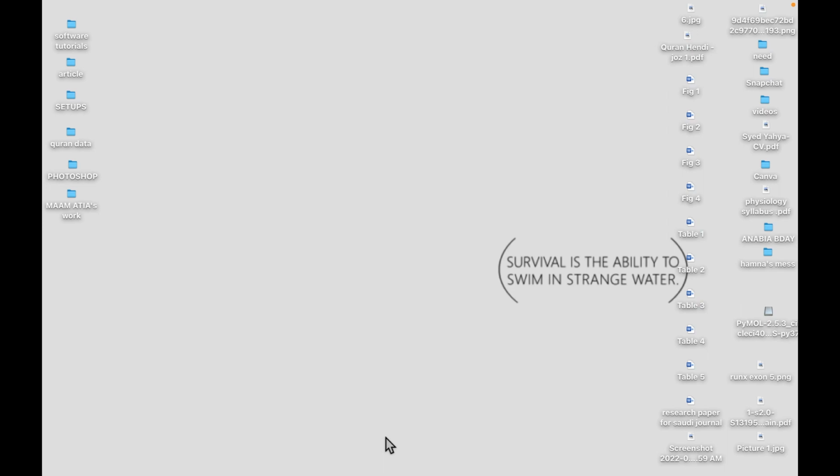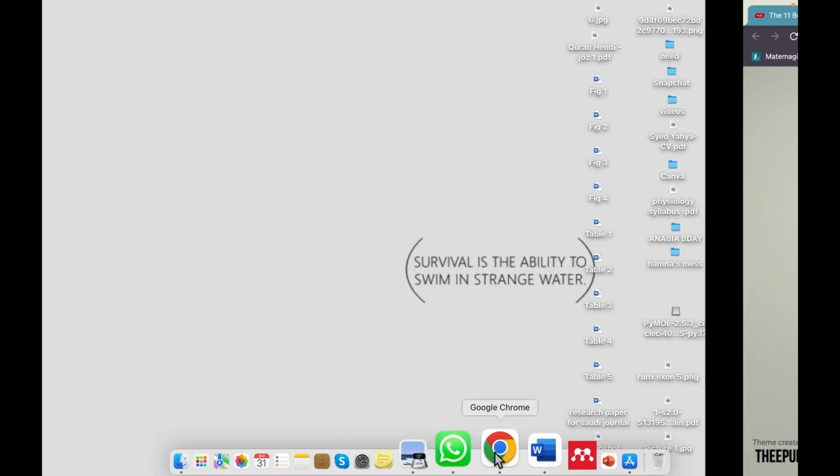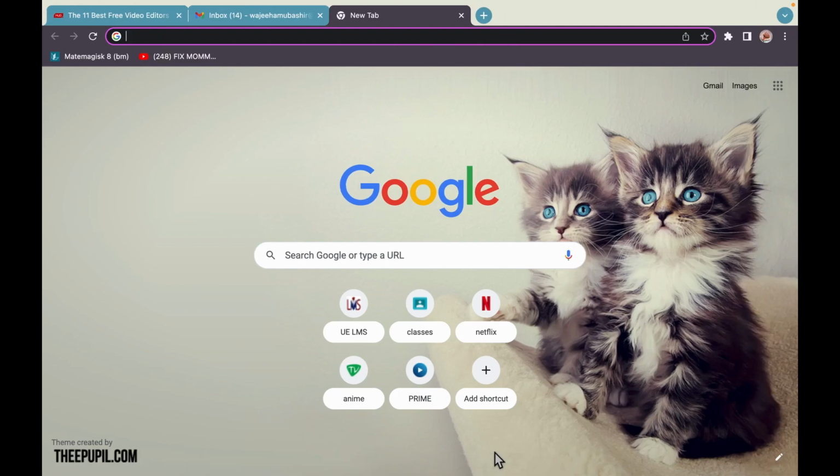YouTube family. Today we are going to learn how to extract amino acid sequence by just using NCBI. So what is NCBI? This is actually a database, which stands for National Center for Biotechnology Information. Alright, let's start our tutorial.